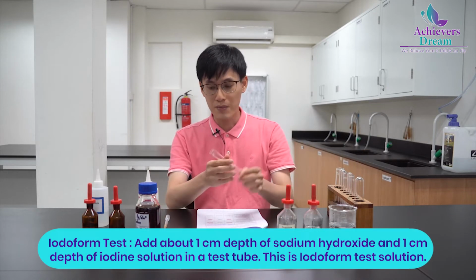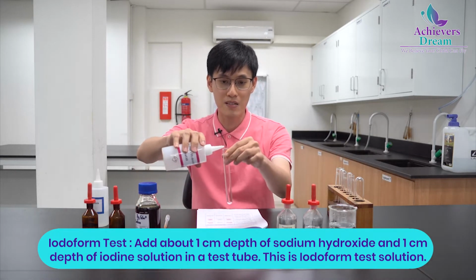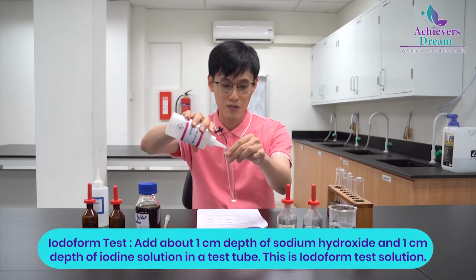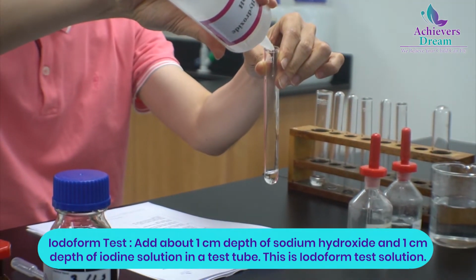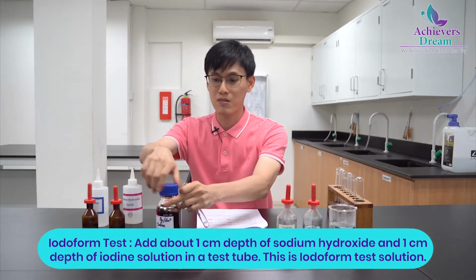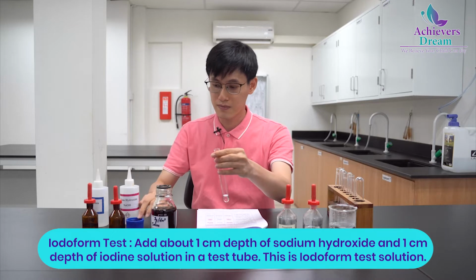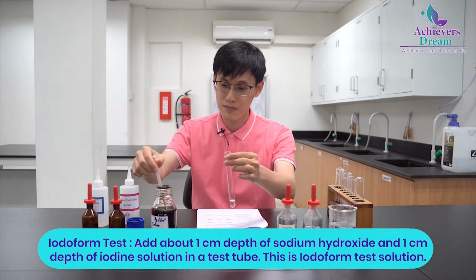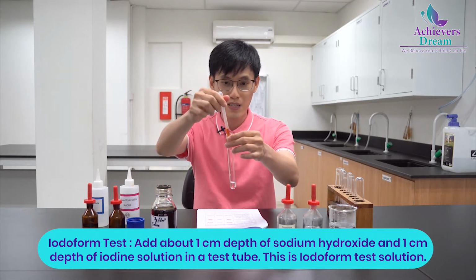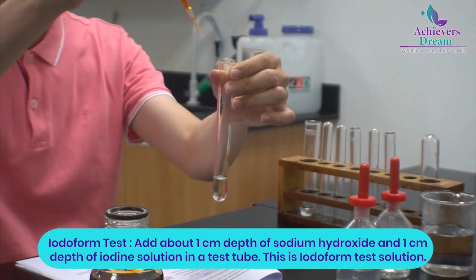So for the iodoform test, what we will be doing is the same thing, same as the alcohol test. We will be adding about 1 cm depth of sodium hydroxide in a test tube. After that, adding about 1 cm of iodine solution.